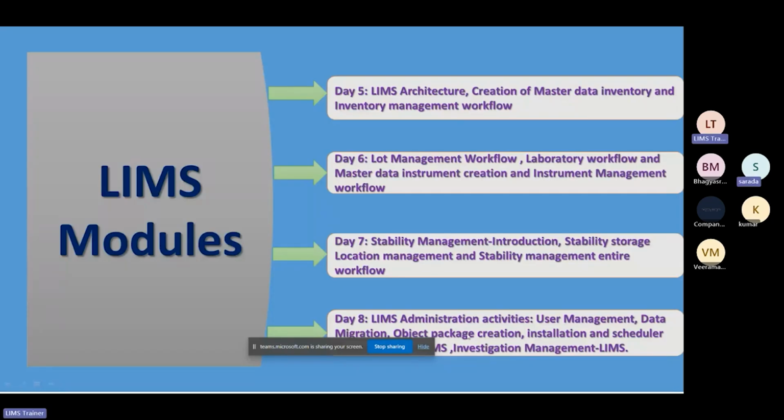And on day 8, the last day, we will see LIMS administration activities, the user management, data migration, package creation, installation, and scheduler. All these activities we will go through on day 8. Okay. So this is the actual course, the 8 days course.